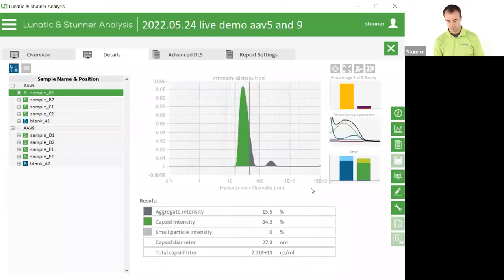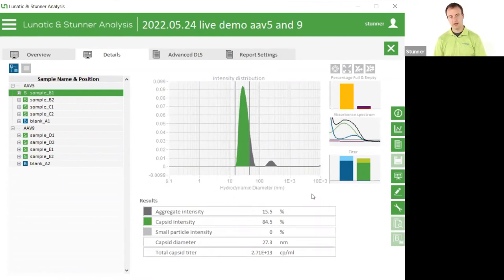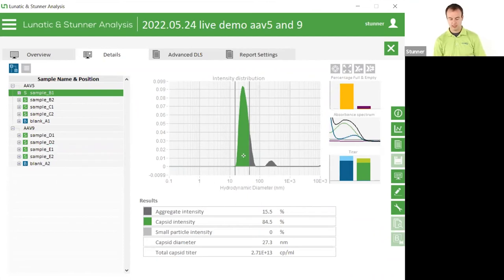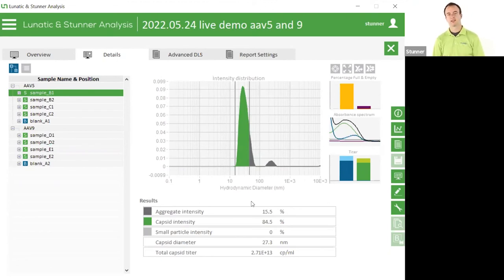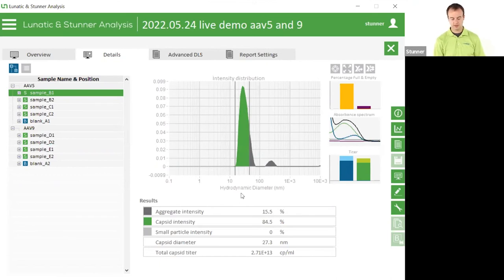We also have DLS present in Stunner - let's check that out. Here we see a distribution of the size and any kind of aggregates that are present in this sample. For an AAV sample, we'll expect that result to have a peak somewhere around the 25 to 30 nanometer diameter range. What we're showing here in green is the total amount of signal from static light scattering, which is just an intensity, and it's going to be the total amount of signal coming from just your capsids. This is going to be the starting point for our capsid titer information. All of that green area under the curve is what gives us that very precise capsid titer answer.